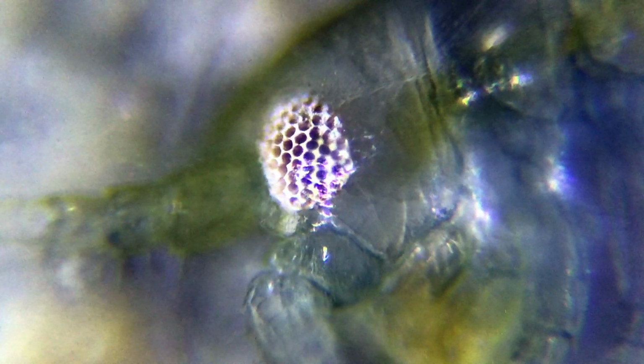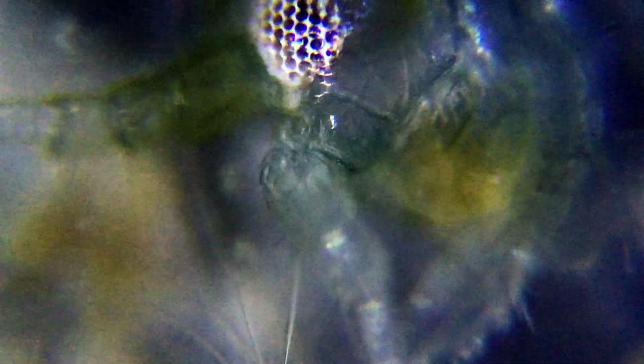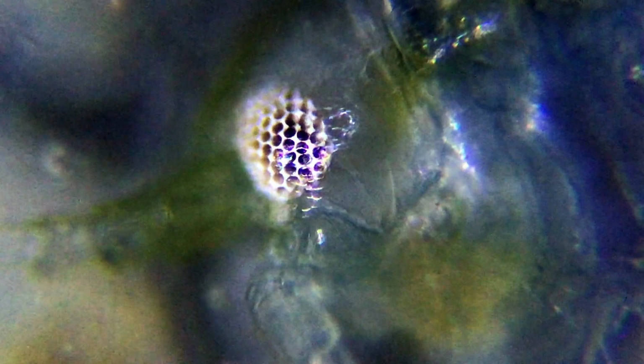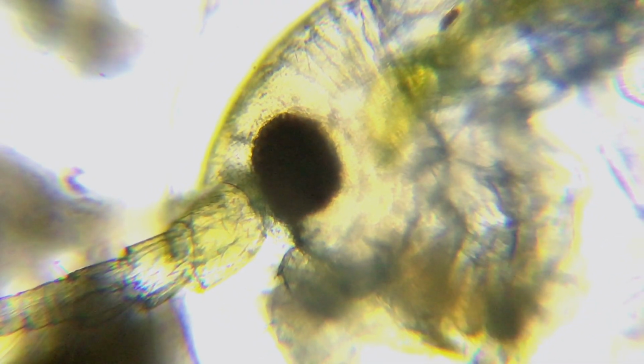Here we have darkfield of that same creature we were just watching, and it's on the eye. I just really love how different the eye looks, how much brighter it is. It looks like we took a picture of honeycomb and made it too bright, with a glowing spot in the middle. When I first saw it, I thought it was some big creepy thing, but we actually found two of it in the same sample.